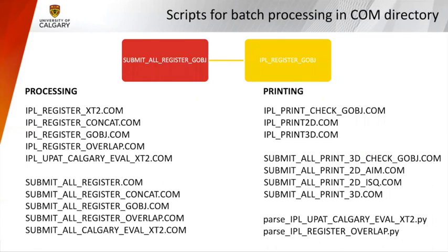To be able to do the 3D registration, we have a lot of scripts, and that's what these are all named here. Some of the scripts are for the processing, and I'm going to show the workflow for the processing in a second. Some of the scripts are for generating prints. That extends to these scripts, the 2D and 3D images that I was just talking about.